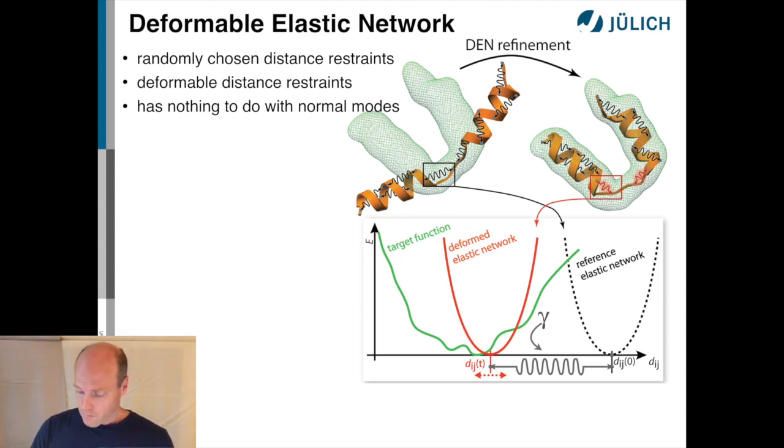And of course, if we allow the minimum distance to adapt to any point, then we will very quickly forget about our reference model, our starting structure.